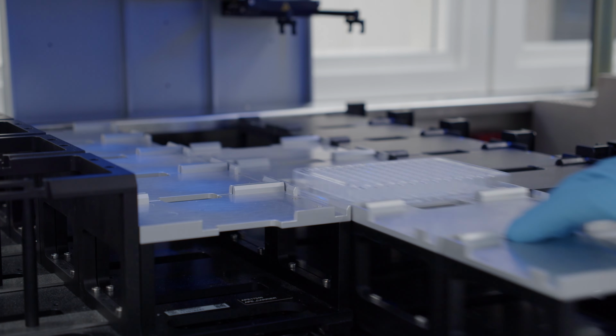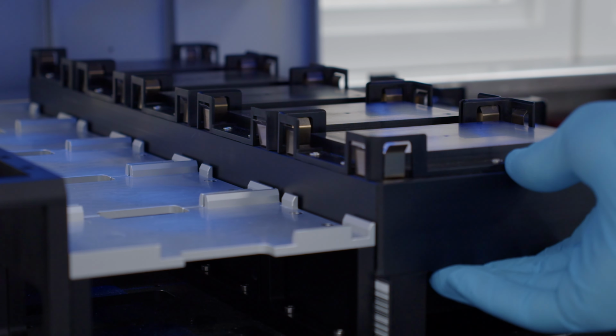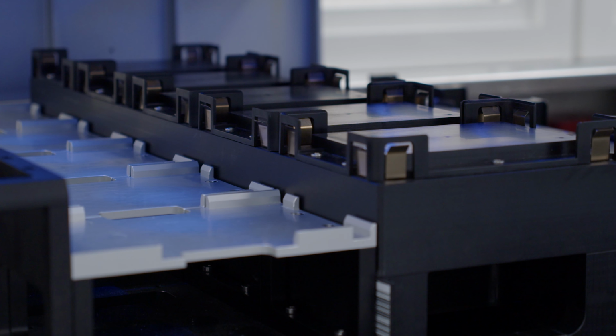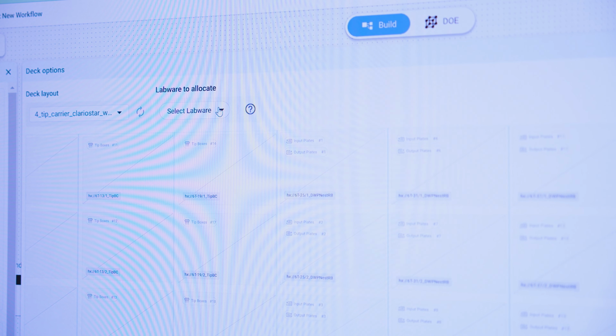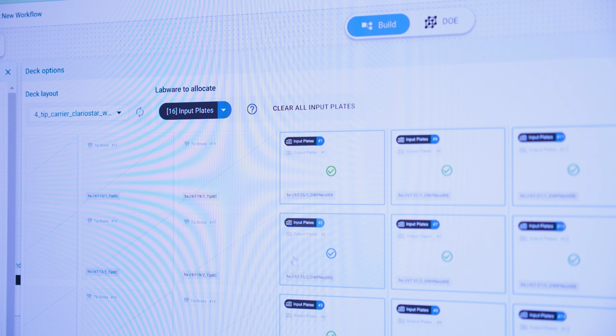Although the carriers are interchangeable, if you do change them, you'll need to upload and select the new deck configuration in Synthace, and that's not covered in this video. If you want your input or output plates to be in a specific deck position, you can specify that here.